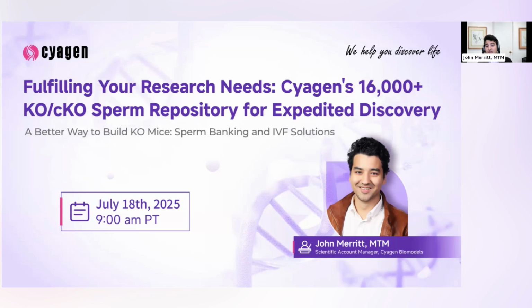Like we can just knock out just Lamp2B on exon 9 for you. We can also knock out all three of the isoforms by targeting earlier exons in the 5' proximal region, like I think exon 3. Regardless, when we design these strategies, we take that in mind. Hope that answered your questions.